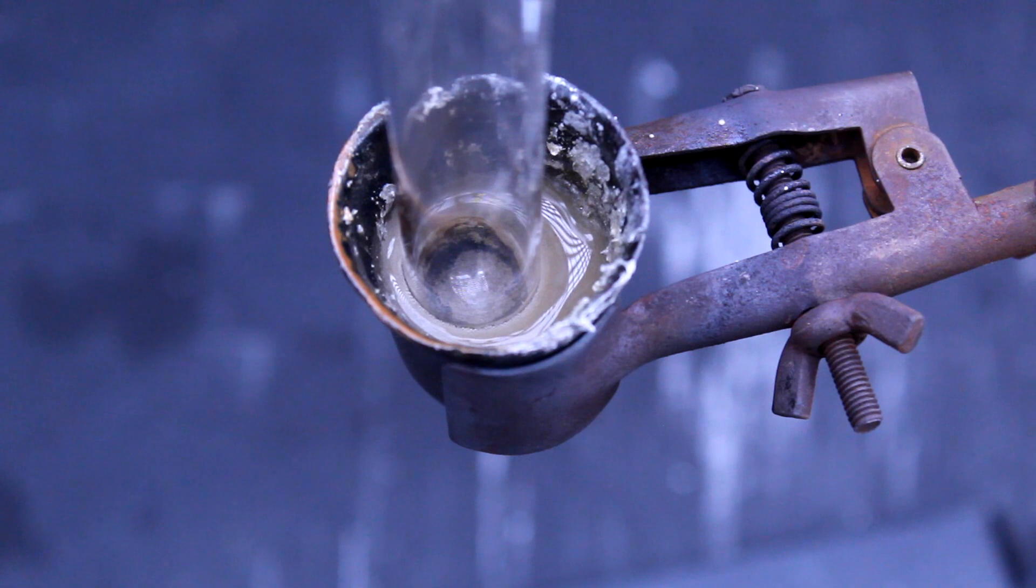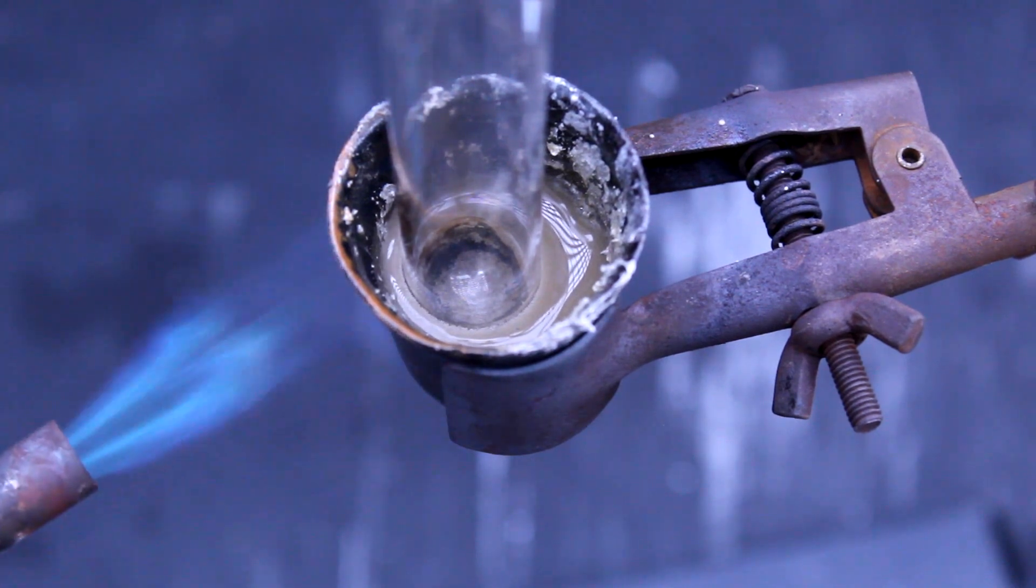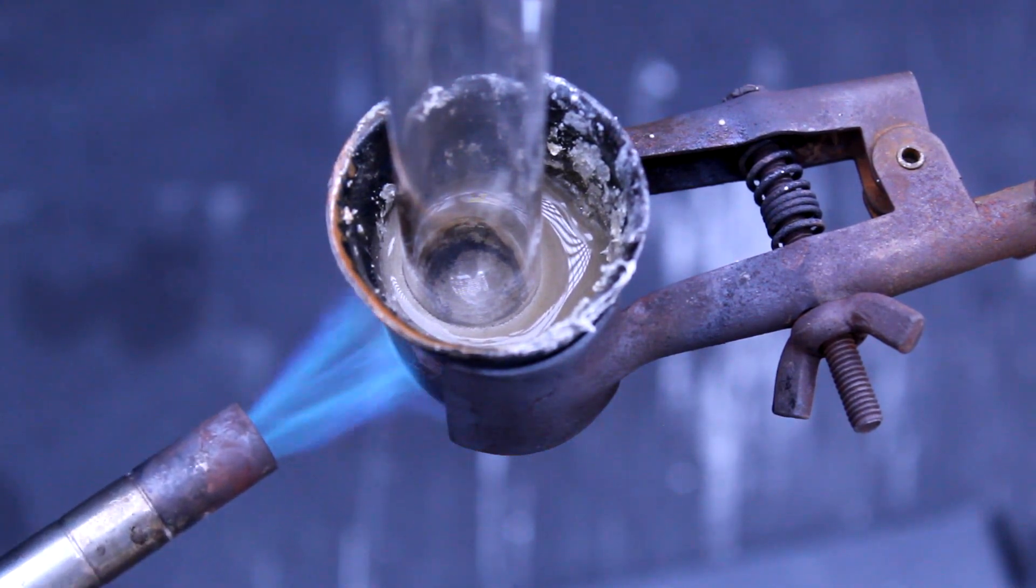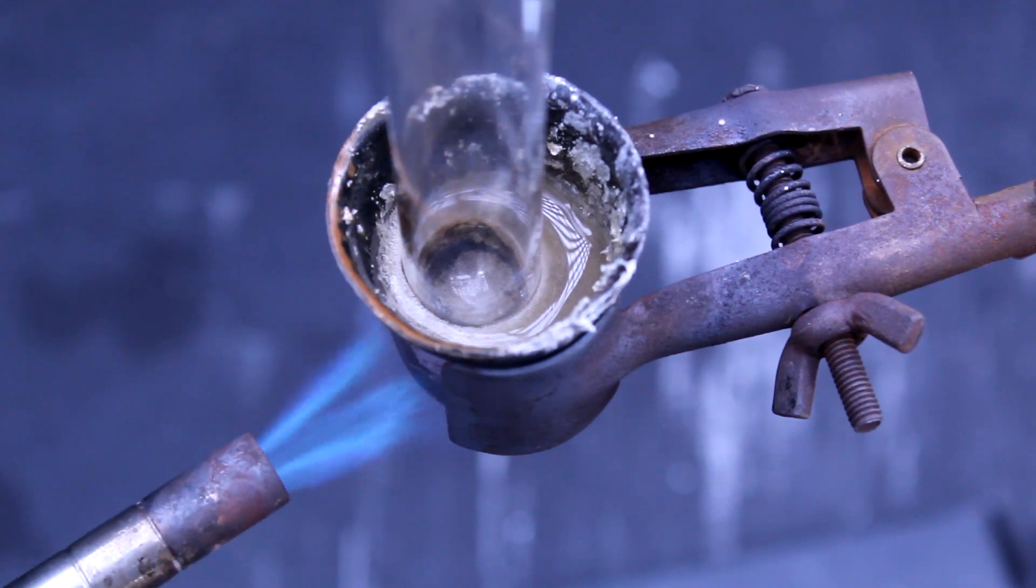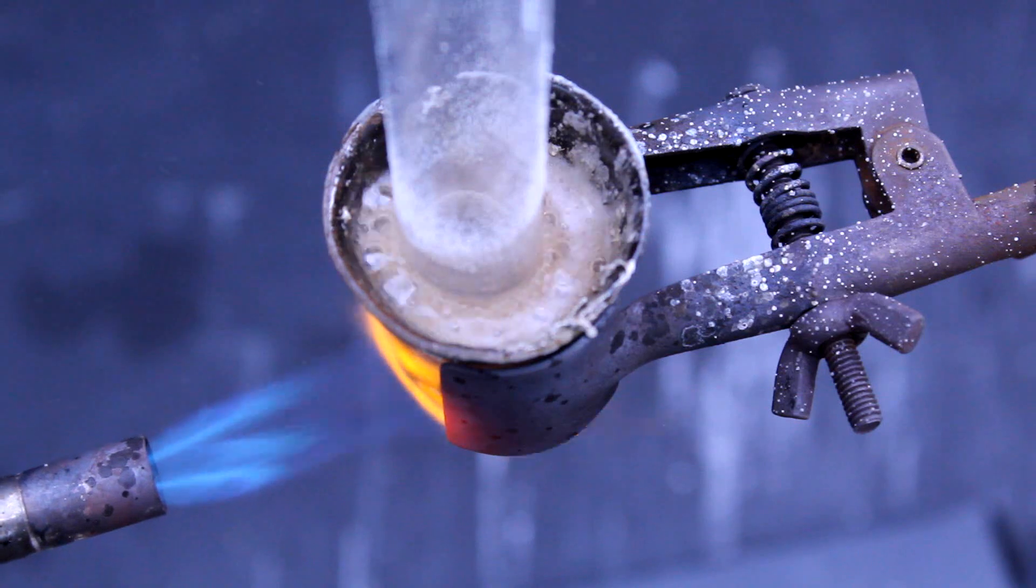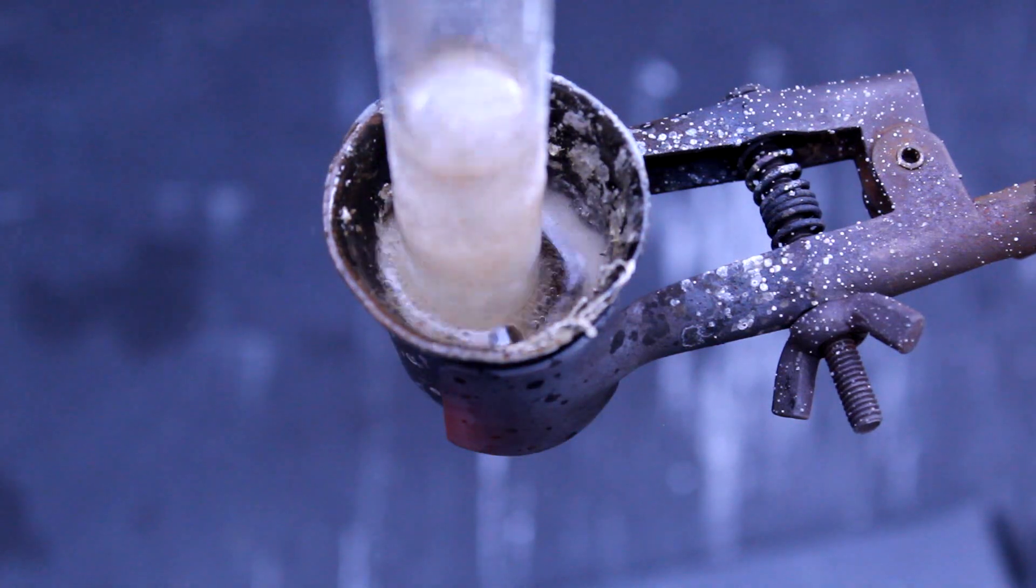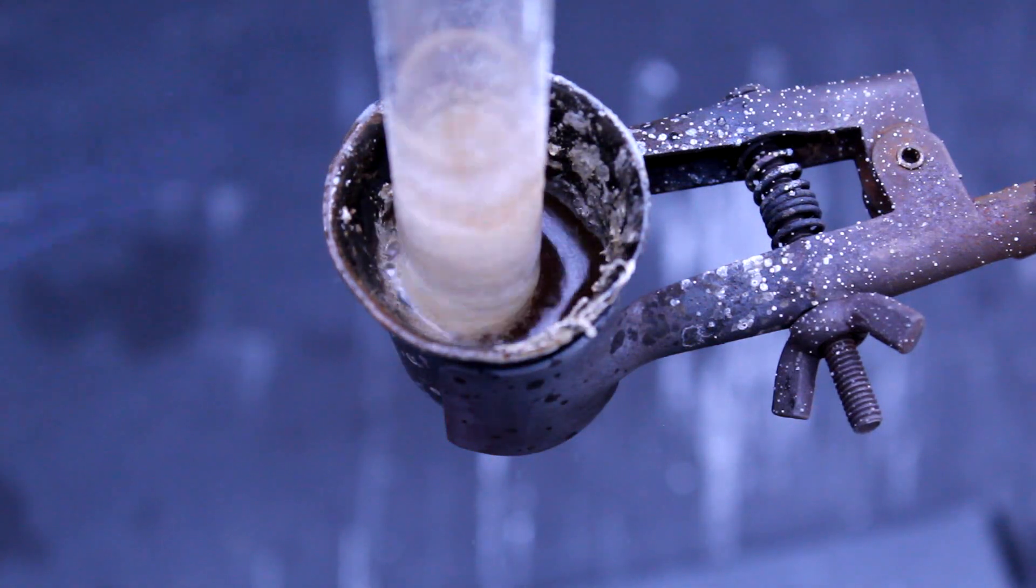Sodium silicate doesn't really have a definite formula, and its properties vary depending on how much glass is dissolved into it. If the mixture contains higher levels of glass, it will dissolve more poorly in water, have a lower pH, and will melt at a higher temperature. Since I want all my glass to melt and dissolve in water later, I'll be using more sodium hydroxide than silicon dioxide.